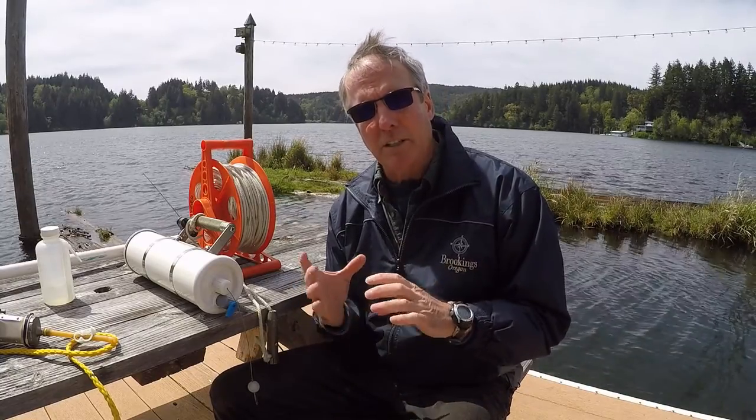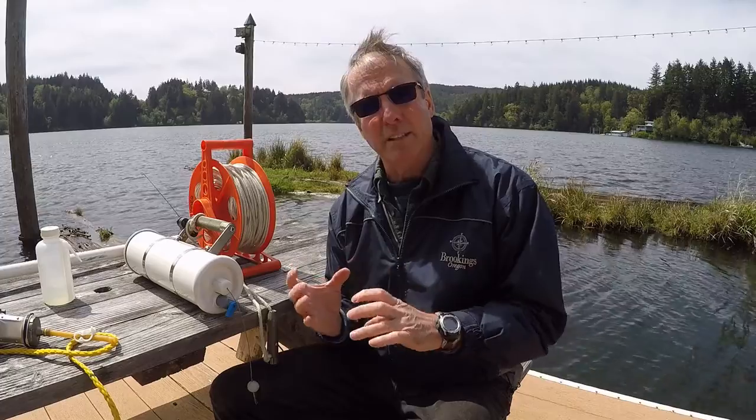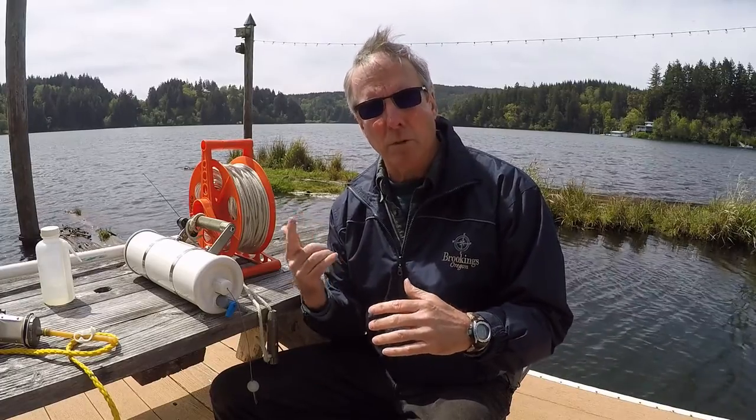And then we talked about the data zone, where the information is contained within the unit itself. So if you could tie a rope to it and lower it to a position in the lake or in the ocean or anywhere else, you were able to take continuous readings with that, which is really handy for doing thermoclines and all kinds of depth profiles and other things.